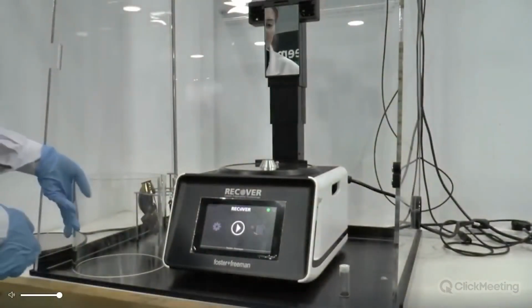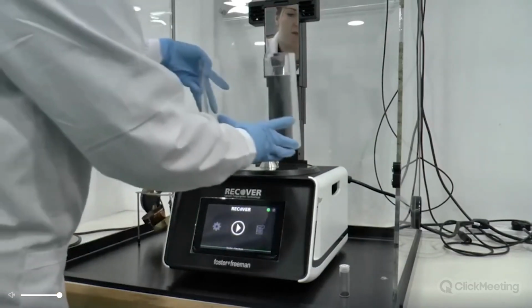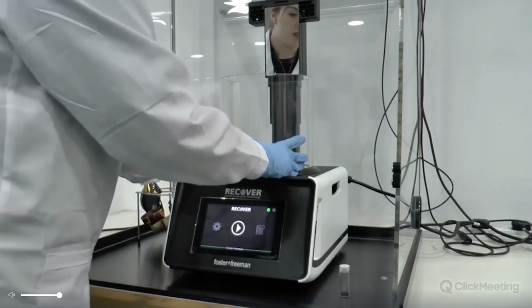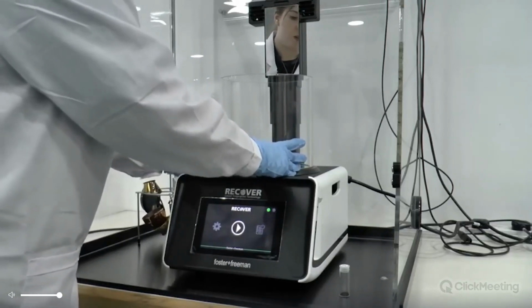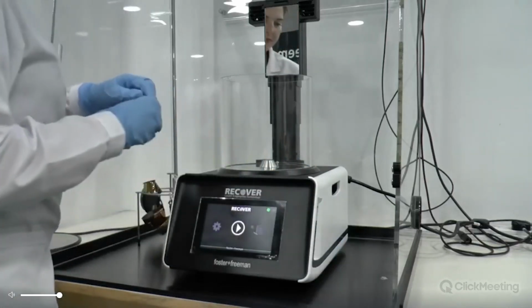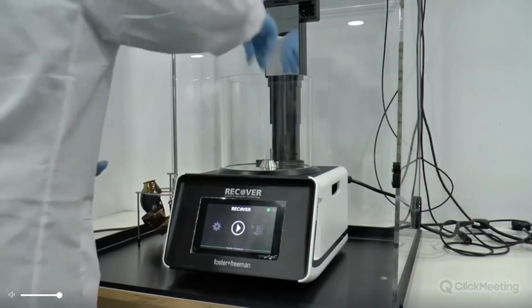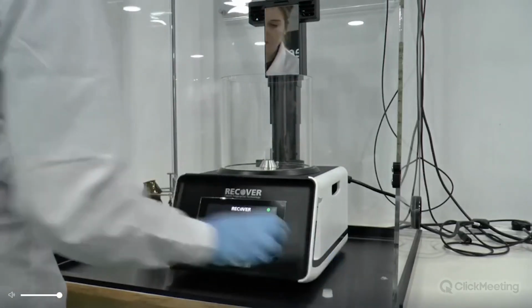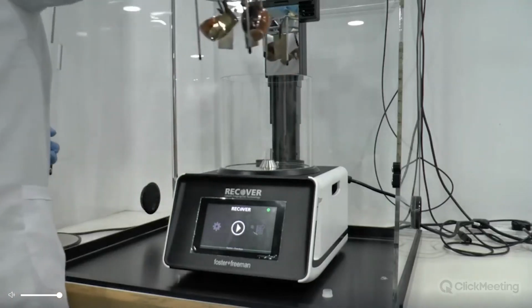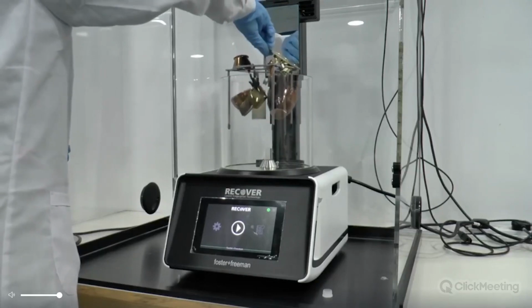Okay, here we have our LFT Recover instrument. We can use this on metal types which have been exposed to extreme conditions, such as heat, as we have seen with our evidence. We fix the chamber in place, then we take the chemical, place it inside the chamber, and then with our evidence fitted onto the evidence rack, we will lower it gently into the chamber.